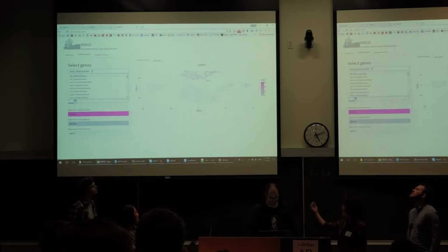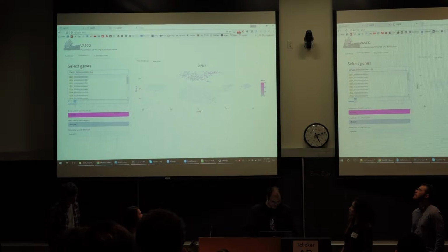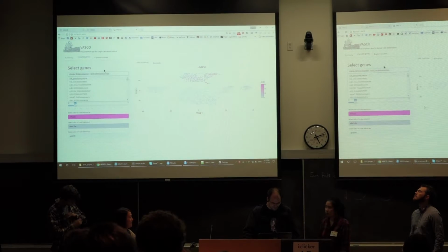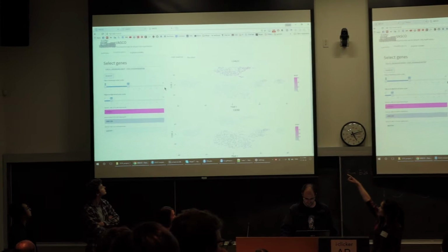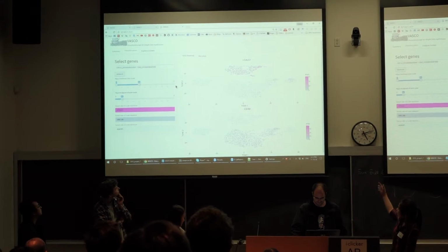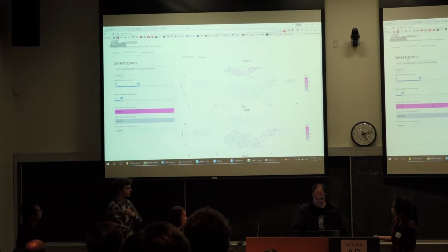So what we see here is a scatter plot of the 3,000 cells. The color represents the level of gene expression. The gene up there is LGALS1, which is a marker for monocytes. And so we see here that the cluster up there is highlighted pink, which represents the level of expression. So we might infer that this cluster up there is the monocytes.